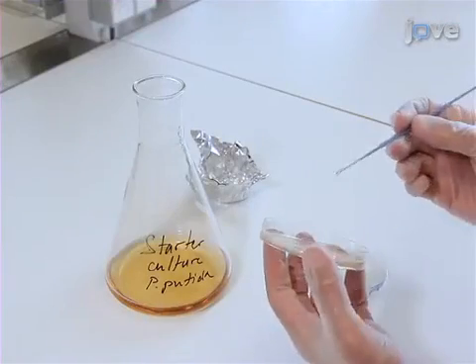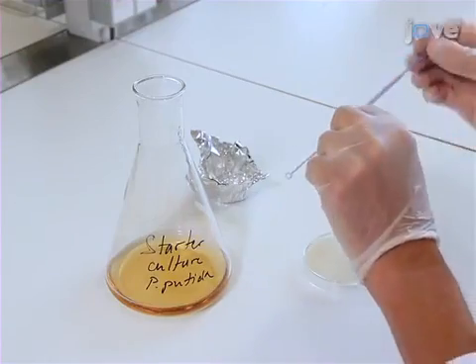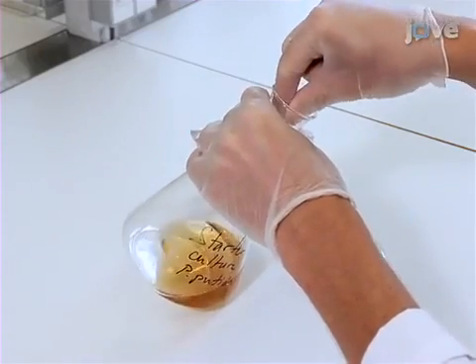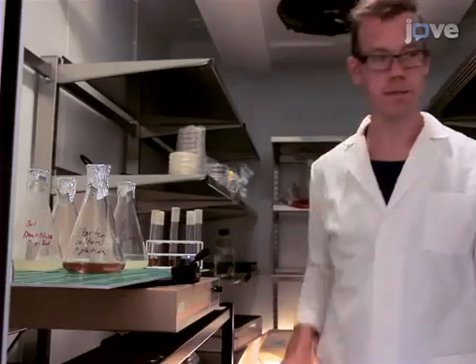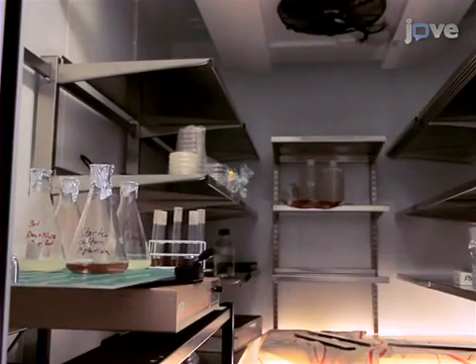To prepare a starter culture of Pseudomonas putida, begin by inoculating 100ml of tryptic soy broth, or TSB, with a colony of cells that have been cultured on agar supplemented with tryptic soy broth, or TSB. Incubate the culture at 30°C, shaking at 130rpm for 7 hours.